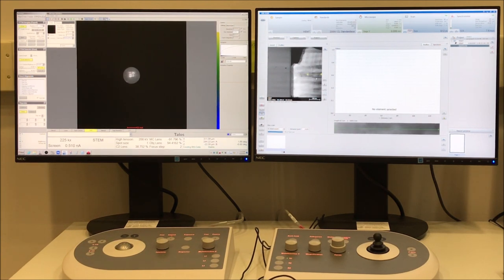So now we can just click and drag on that line and position it however we want. So I'm trying to keep the line perfectly horizontal. And because I oriented the image with those interfaces running up and down, I can get a nice orthogonal scan. You can see under the spectrum, a sort of close-up area of the image where the scan will be taking place. So if you look at it, there are kind of five distinct layers that we're scanning over.